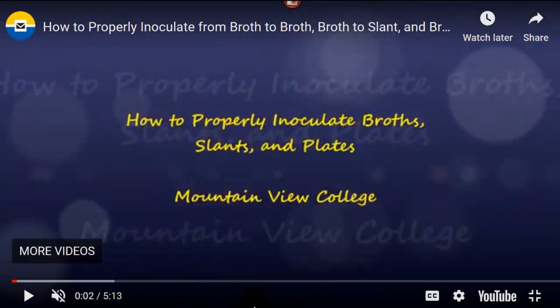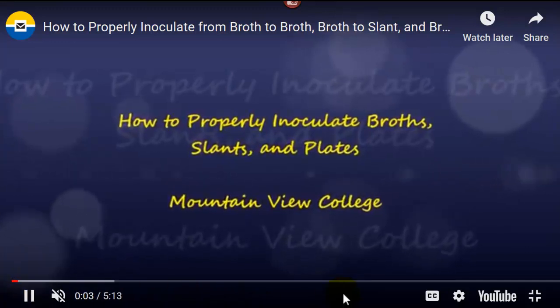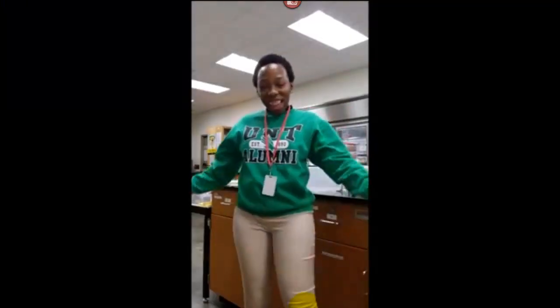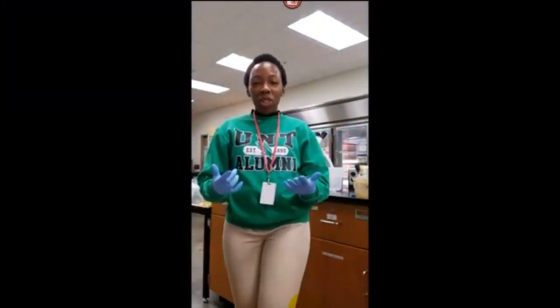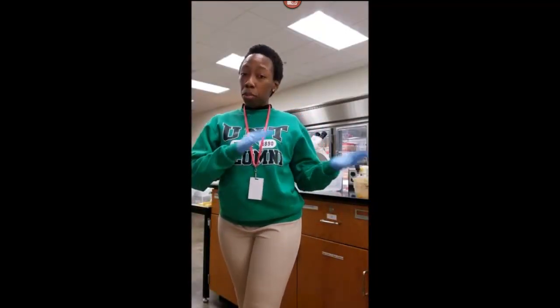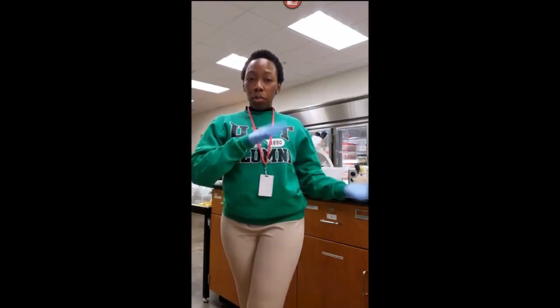This video is going to show how to transfer cultures between different media, agar slants. And the heading on this video says from broth to broth, from broth to slant, and then from broth to plate, which is what we've done in our micro labs in the past. So let's see how she does this. Now she's explaining what she's going to do. And I'll probably just speed up and go right to the action.